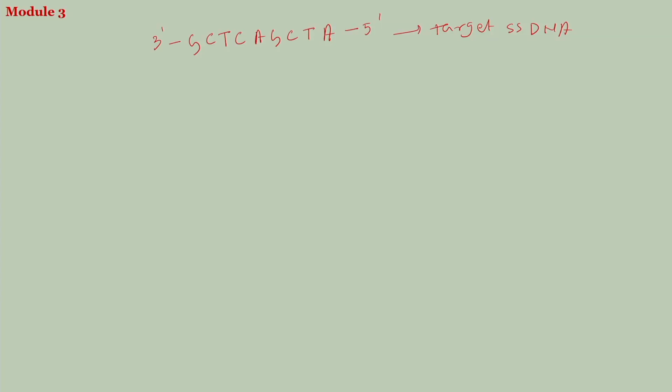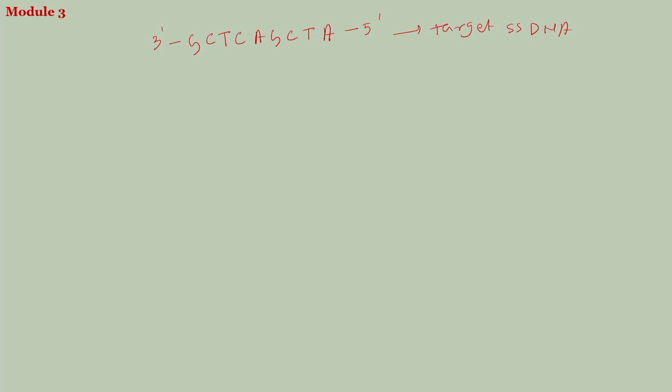They prefer that the target DNA is longer than 50 nucleobases or 50 base pairs, and only then can you proceed for the sequencing. The reason is you have to use a primer, and the primer itself is 15 to 20 bases long, so your target sequence has to be a little longer than that. I am not drawing the primer part, I will start straight from here.